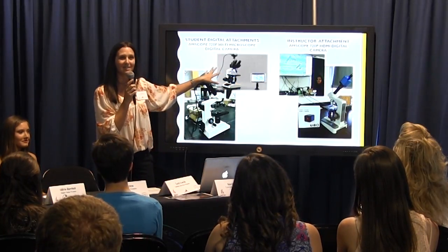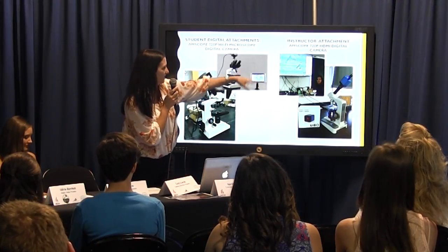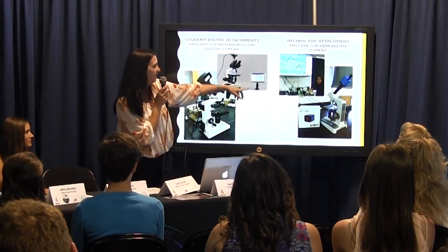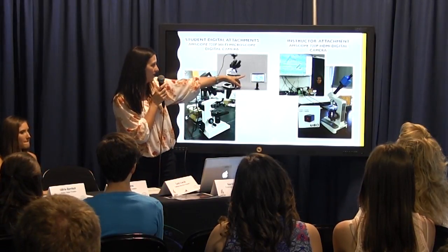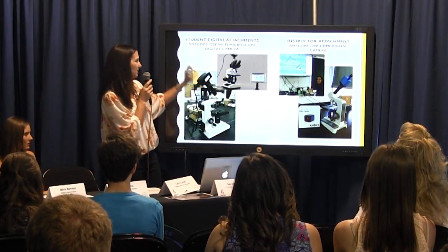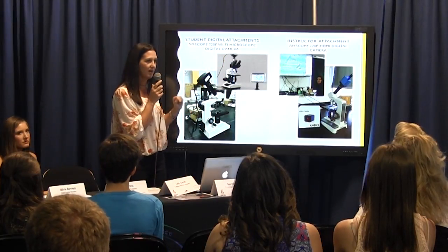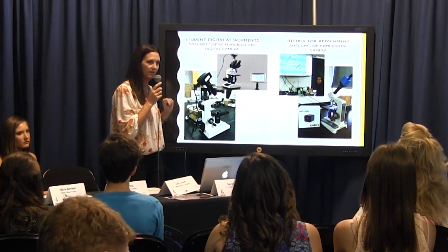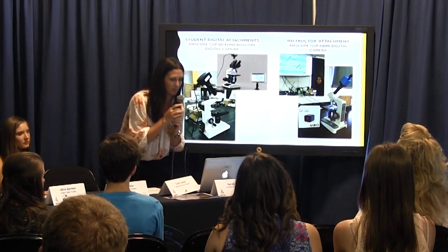And you'll see some of the stuff they found. Then I got one teacher instructor one, and it connects to the television through HDMI. It does still images, saves on an SD card, but it doesn't do videos. But they really like this one. So I can see exactly what they're doing, instead of, okay, you try, now let me look, now you look, now me. So we can see at that moment what they find.